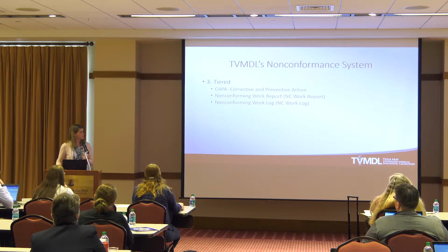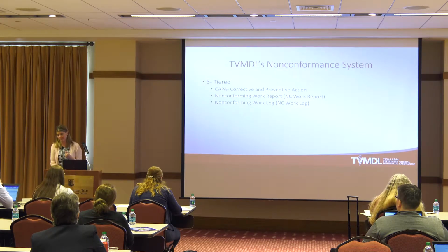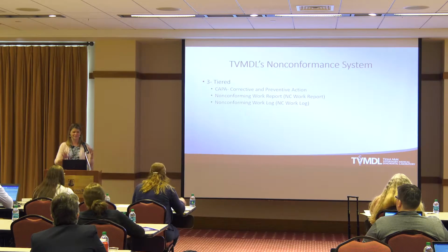The difference is, for the corrective and preventive action workflow, it comes to QA after every step. So the workflow is initiated, comes to QA, and as quality managers, we will issue the citation against the standard, send it back to the section to do their root cause analysis and corrective action plan. It comes to us and we'll approve their plan, because their plan may be, we're just going to go talk to Bob and tell him not to do that again. And we have to say, well, it's not really a good plan because, what if Joe does the same action, right? I'm sure that sounds familiar to you.